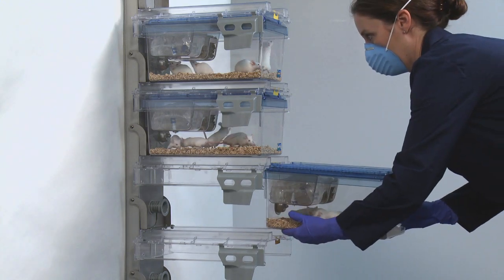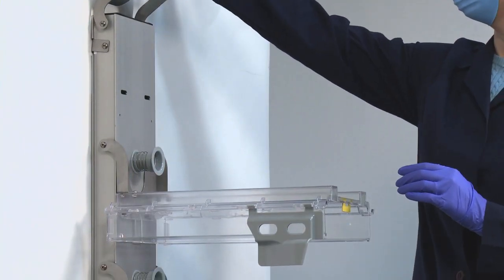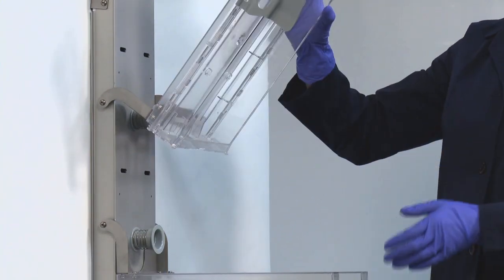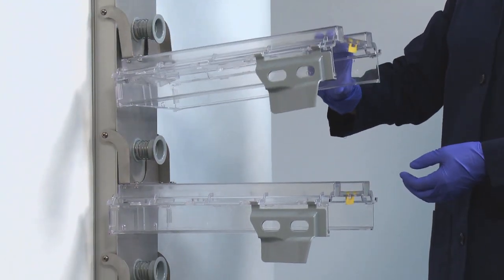The entire unit can be knocked down in minutes. Combination air supply exhaust manifolds have flip-up cage canopies for easier cleaning, handling, and compact transport and storage.